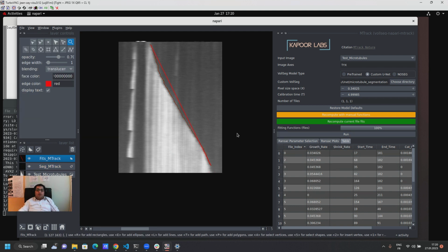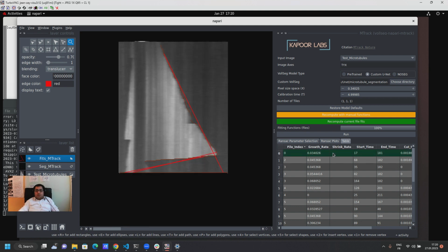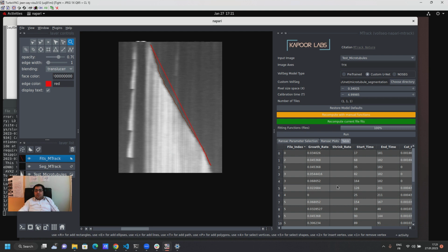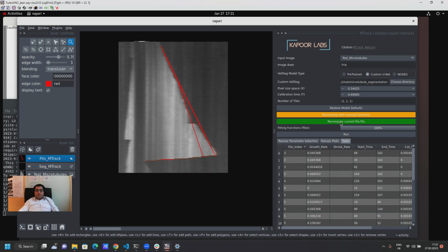And now you say, aha, now I'm happy. Now my file index only has 1 growth event, and so I'm happy with that, which is over here. Yeah, it's just 1 growth event. And now you can go to this file and you say, okay, this is also a bit messed up, probably because the segmentation is not right. So you can recompute this. I say, still not good.